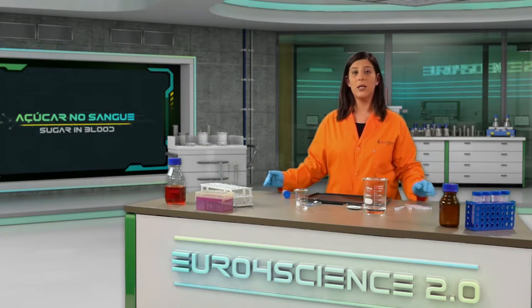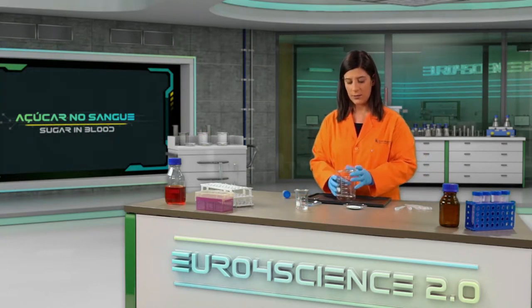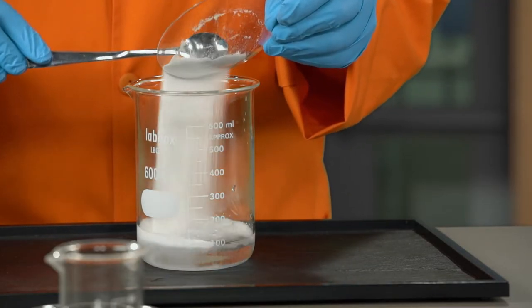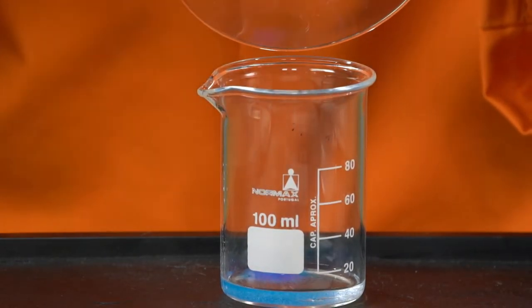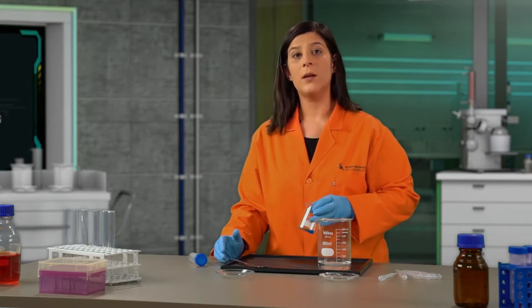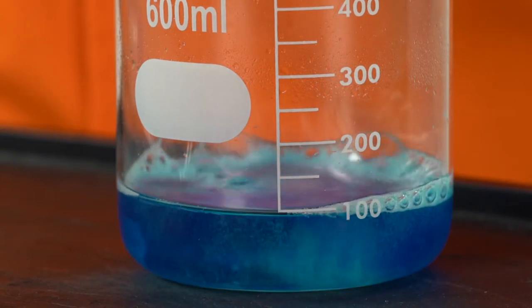Vamos começar por preparar o reagente de Benedict. Num copo com 100 ml de água quente, adicionamos 14 gramas de sal de fruta N. E no outro copo, dissolvemos 1 grama de sulfato de cobre em 5 ml de água quente. De seguida, misturamos as duas soluções, agitamos e temos o reagente de Benedict.